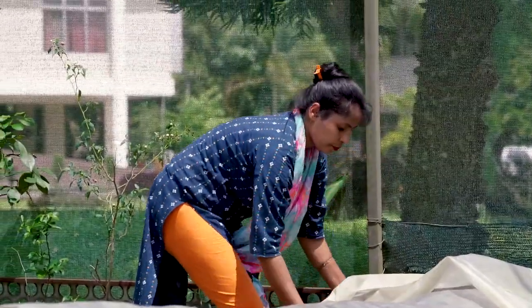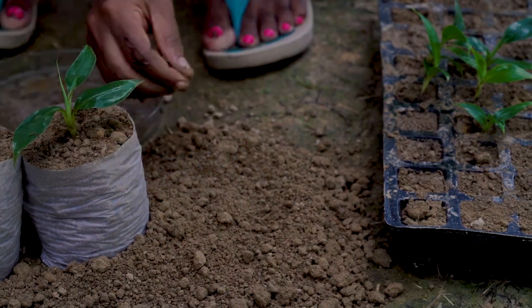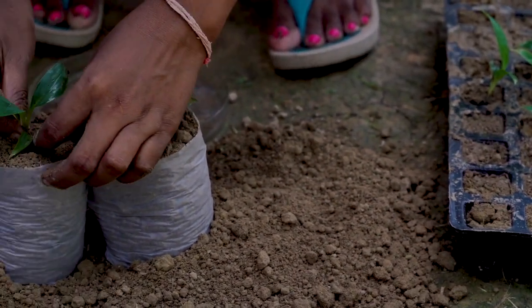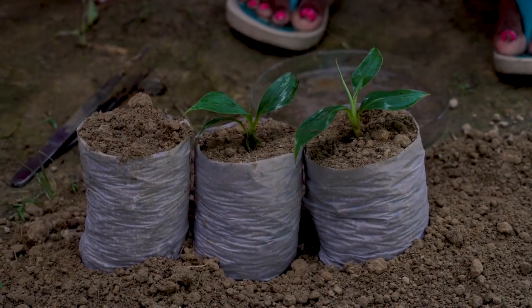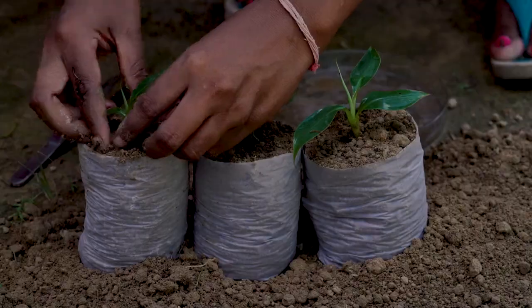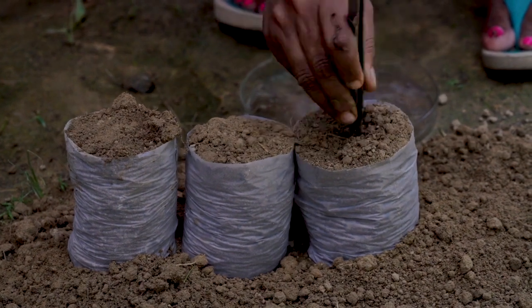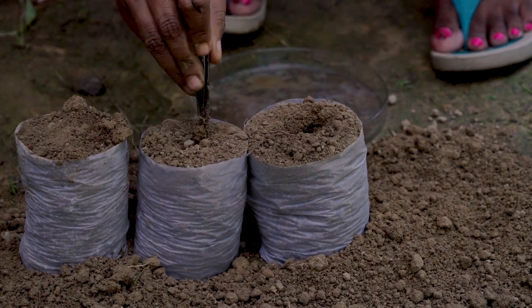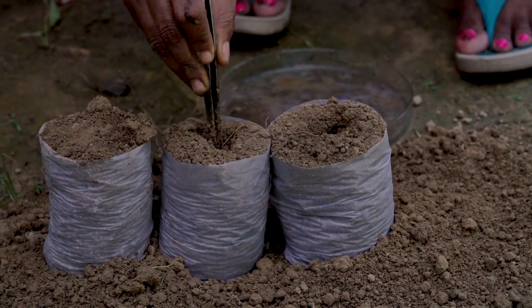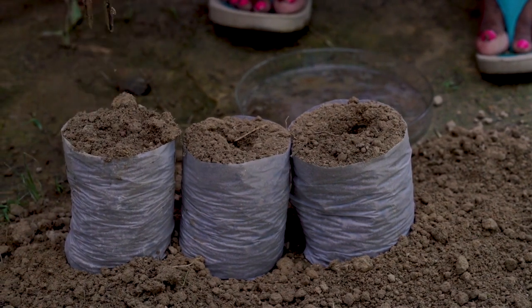And after 20 days, we transfer the plants from the cocopeat trays into the potting mixture in the poly bags. The potting mixture is made up of FYM, vermicompost and soil. The concentration of FYM is 25%, vermicompost is 25% and the remaining 50% is soil. By mixing all this, we prepare the potting mixture.